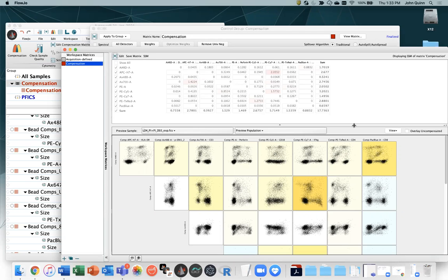Spillover spreading is a way to gauge what the impact of that spillover is going to be. How much error do you think you'll see in your data? How hard will it be to gate on a positive population based on how much that population spreads, i.e. gets wider in non-primary detectors due to the spillover? And so bigger numbers are worse here. What this equation is showing is the relative spread normalized to the intensity. And so a brighter color will give a relatively smaller number for the same amount of spread. So just something to keep in mind there.